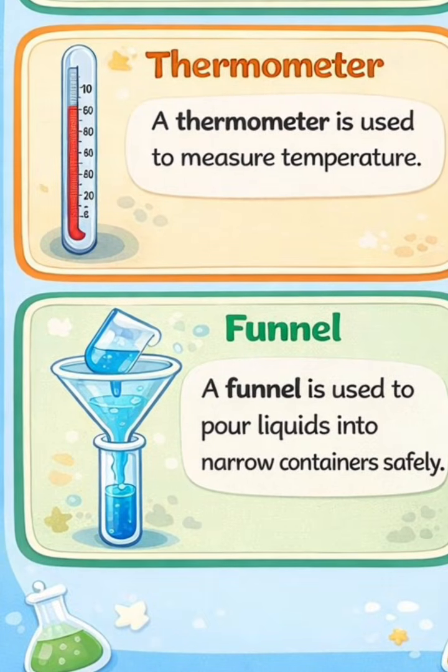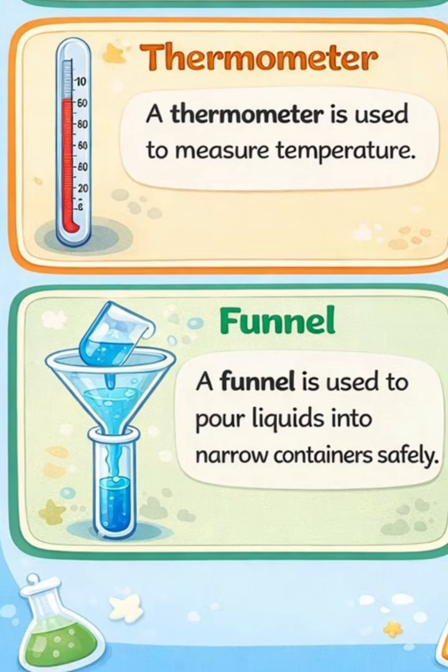Funnel. A funnel is used to pour liquids into narrow containers safely. I bet you all have learned this before. So you use it to fill in maybe liquids into a test tube because the container is pretty narrow.